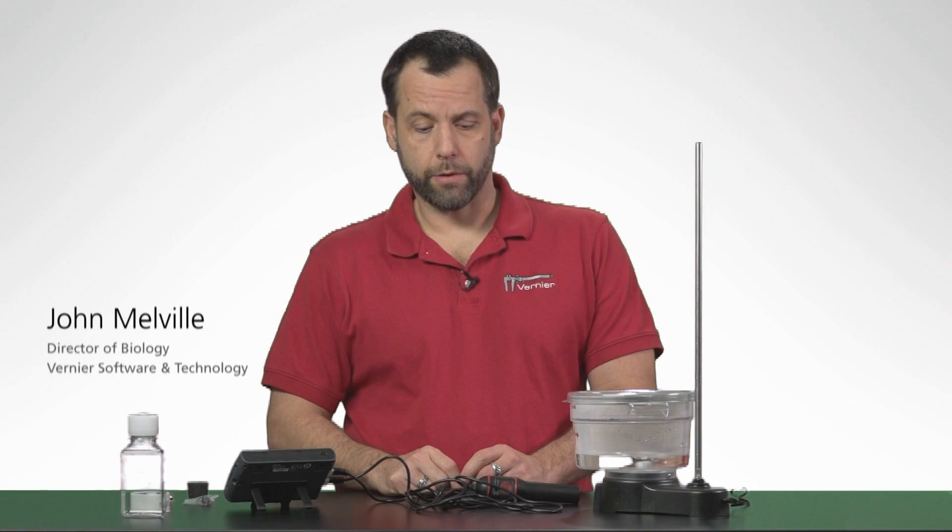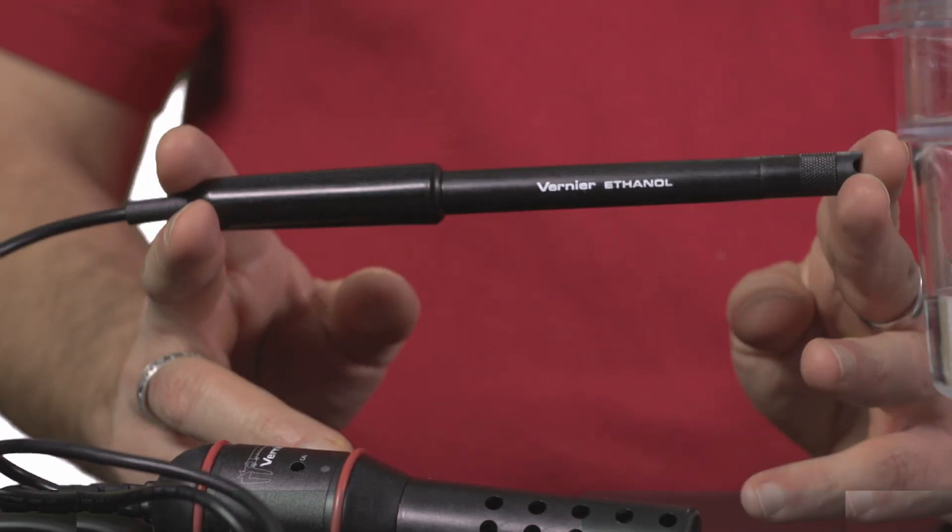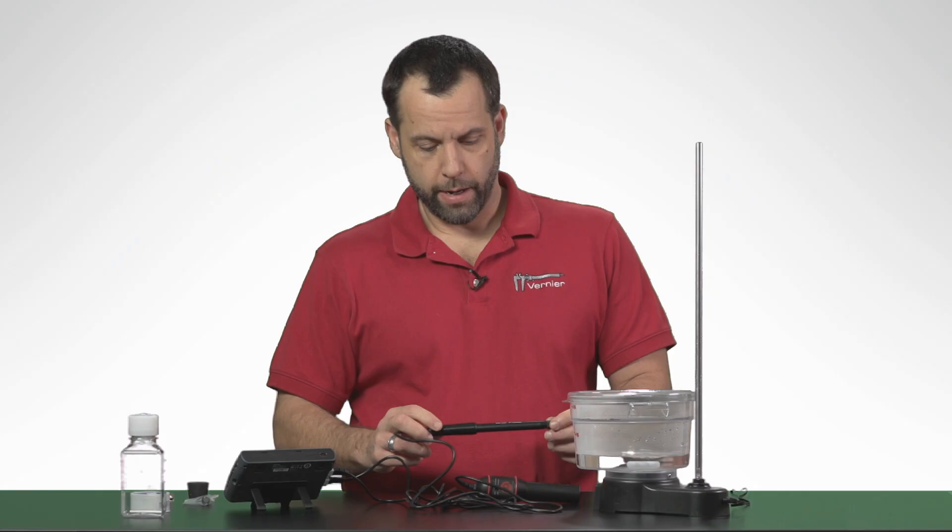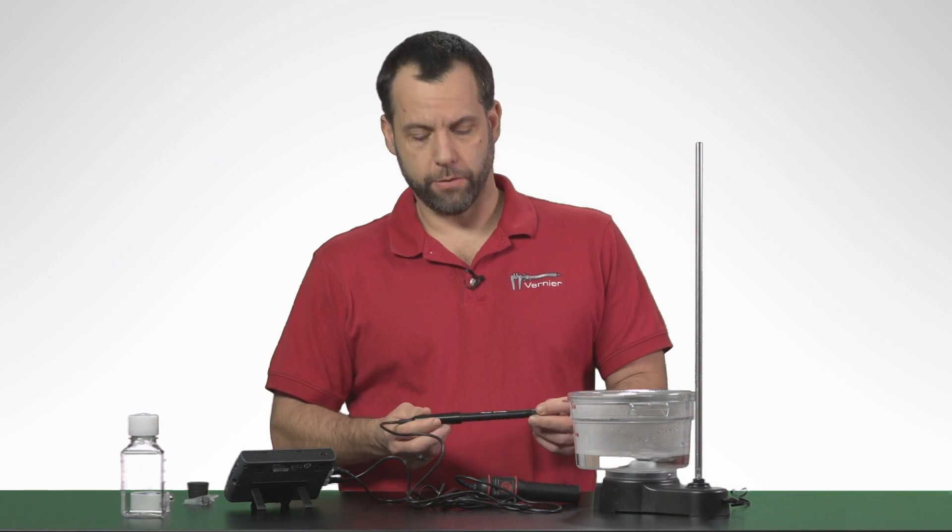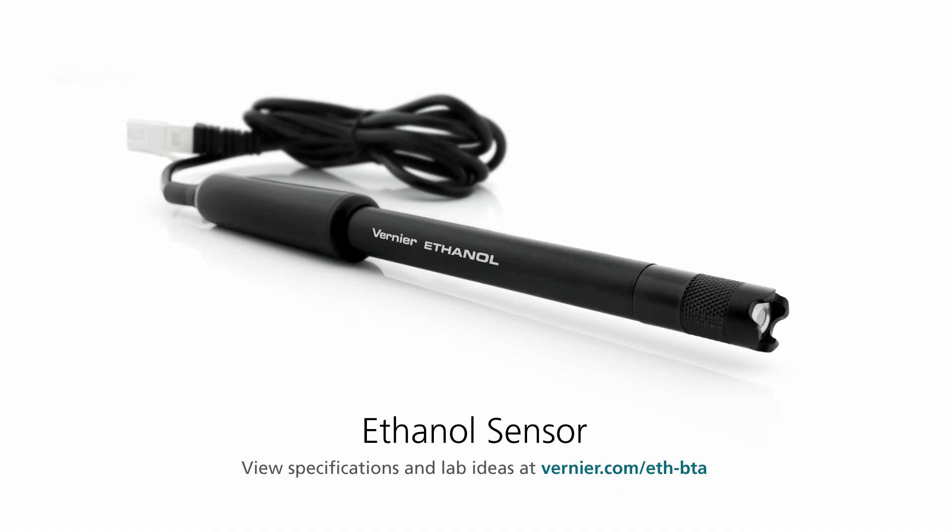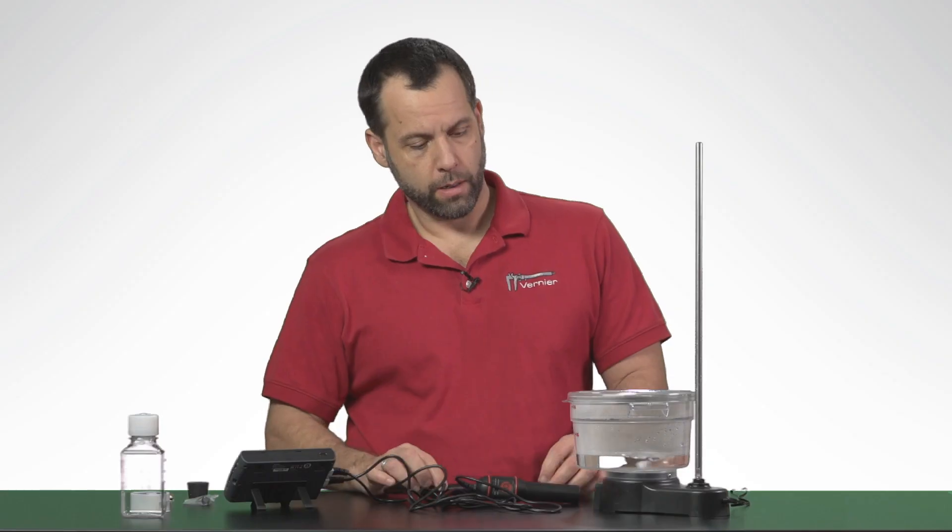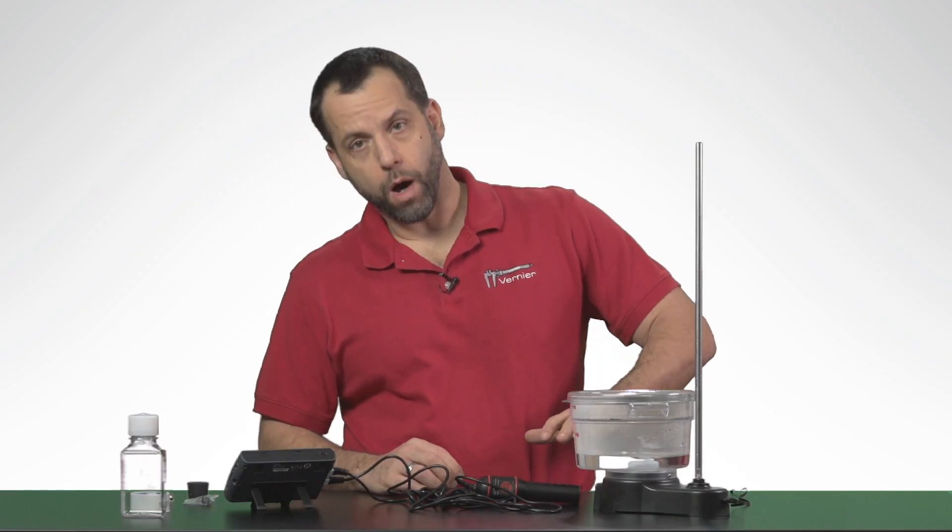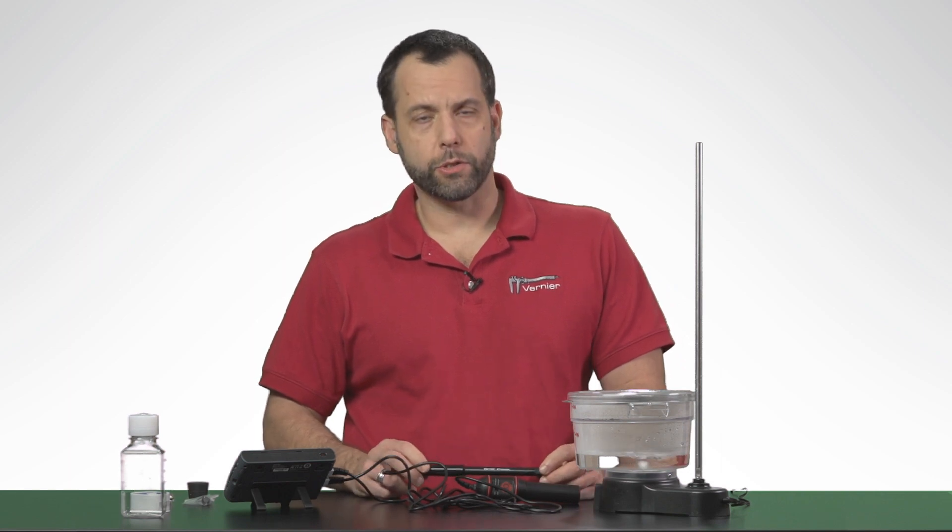Hello, I'm John Melville and I'm here to talk to you today about our new ethanol sensor. This is a little ethanol gas sensor that can be used to measure ethanol gas in a vapor above water. It's not designed to be put into water or any solutions, it's really only designed to be used to measure ethanol vapor or ethanol gas.